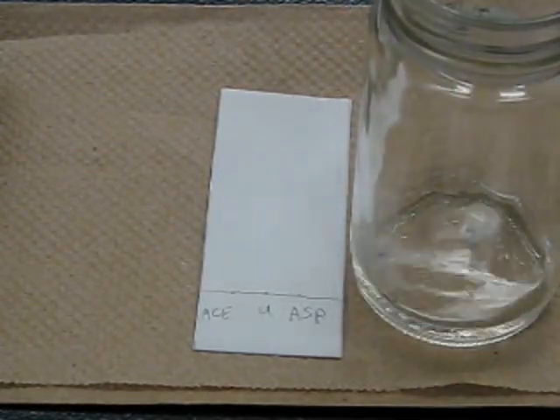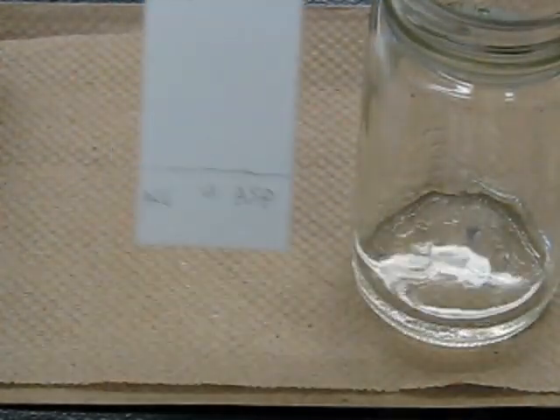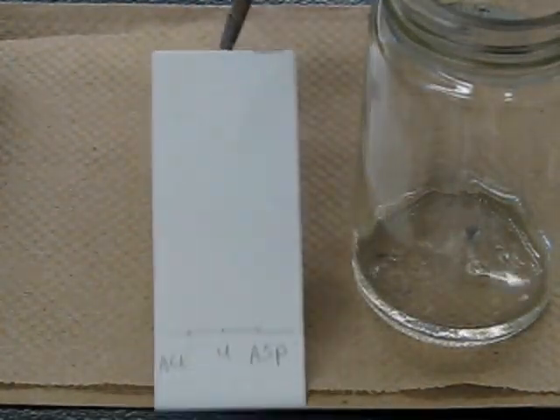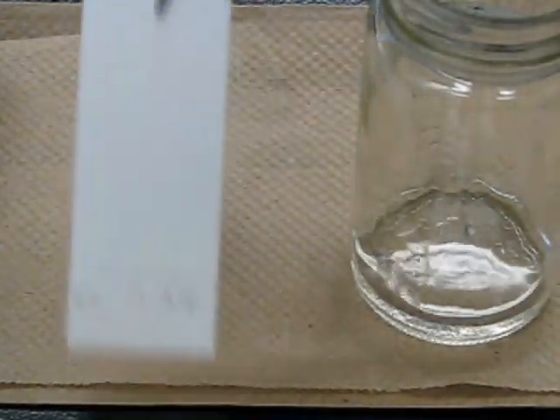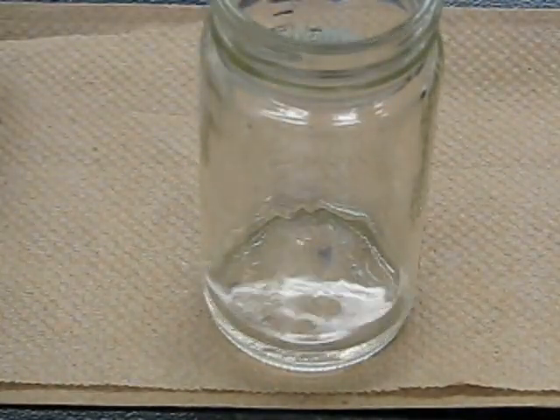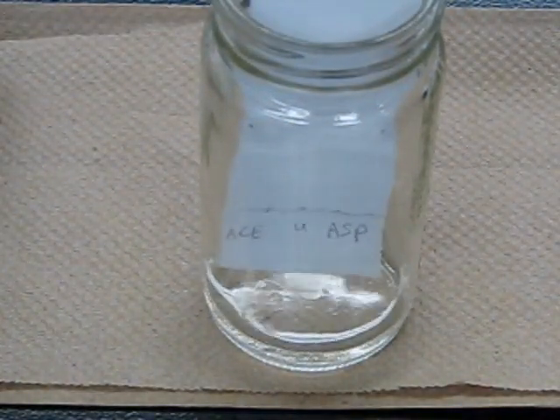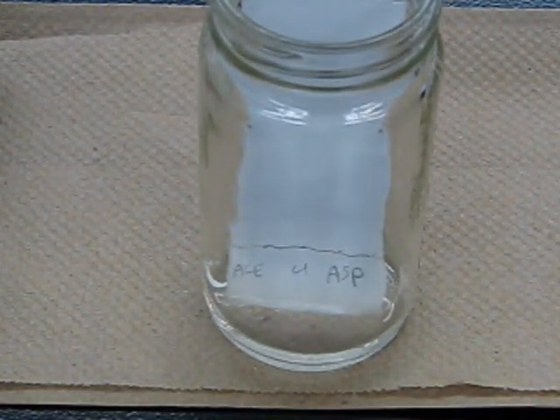Now that you've got the TLC spotted, grab your chromatography jar which should have the eluting solvent - in this case it's a mix of hexanes, ethyl acetate, and acetic acid. You're going to grab your TLC plate with a pair of tweezers, or if you're using your hands, only touch the top. When you set it in the jar, the baseline needs to be above the solvent line.